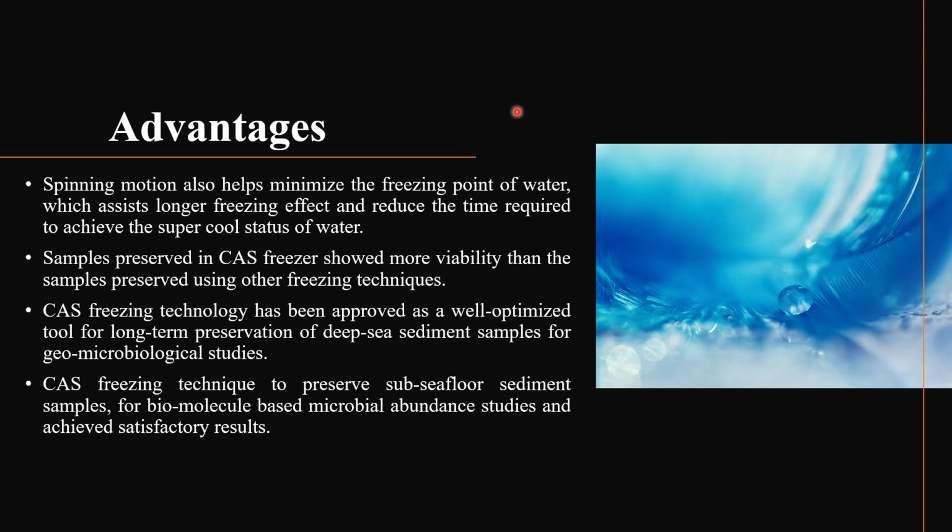What are a few advantages of the CAS technique? First, the spinning motion also helps minimize the freezing point of water, which assists a longer freezing effect and reduces the time required to achieve the supercool status of water. Second, samples preserved in the CAS freezer showed more viability than samples preserved by other freezing techniques.